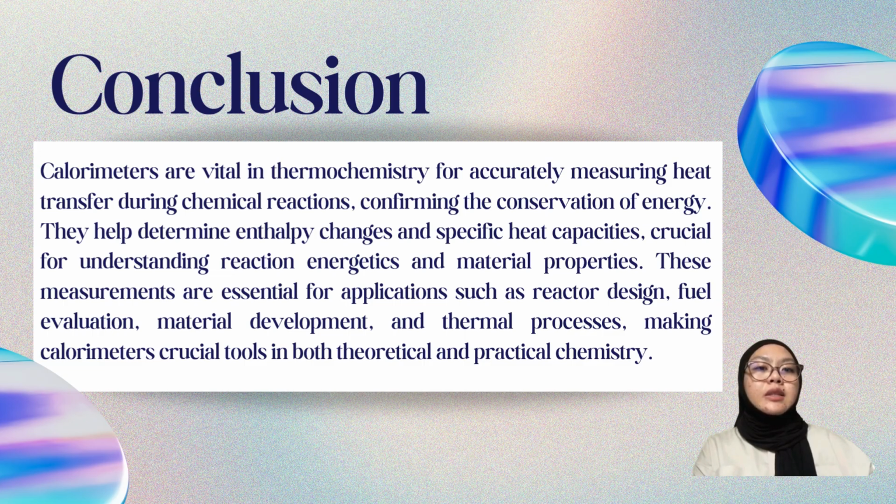Finally, I will end this presentation with a conclusion. As a conclusion, calorimeters are vital in thermochemistry for accurately measuring heat transfer during chemical reactions, confirming the conservation of energy. They help determine enthalpy changes and specific heat capacities, crucial for understanding reaction energetics and material properties.